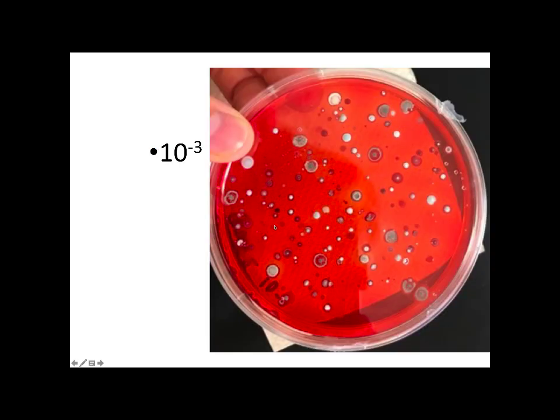Here's an example of one of those CMC Congo red plates, and you can see some of that bacterial growth. As a reminder, you should have all of your plates wrapped with parafilm. You can see it on the edge of this. You are looking for any haloing. It's sort of hard to see on this particular plate, but maybe there's some light haloing around this one, maybe some light haloing around this one.